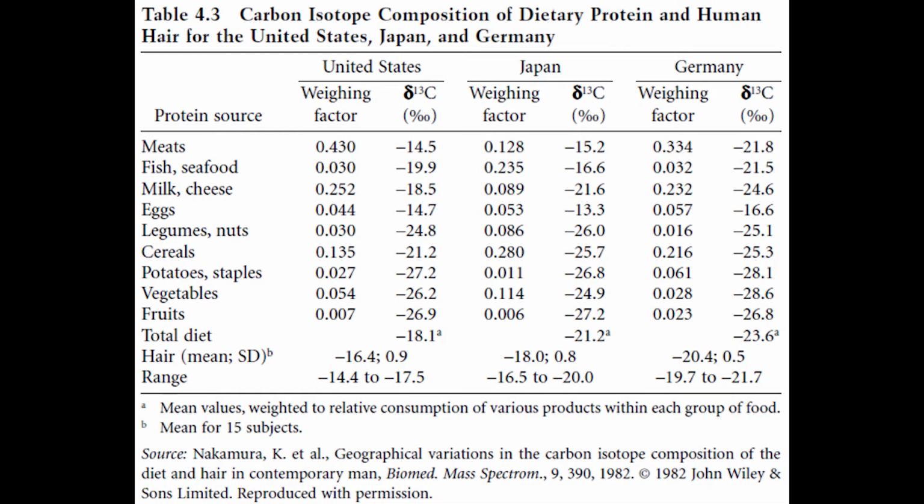So here's a table of delta carbon-13 shifts, and you see they're all negative because this is the carbon-12, carbon-13 ratio relative to PDB. But PDB is the biggest one you can have, so they're all negative. The shifts are all going to be negative. But the shifts can be distinguished from each other. If you're very, very careful and you go out to a lot of decimal places with your carbon-12, carbon-13 ratio, you can find significant differences between these things.